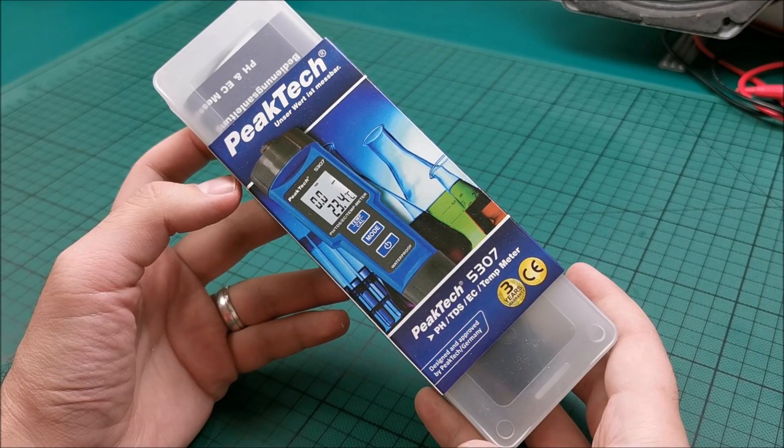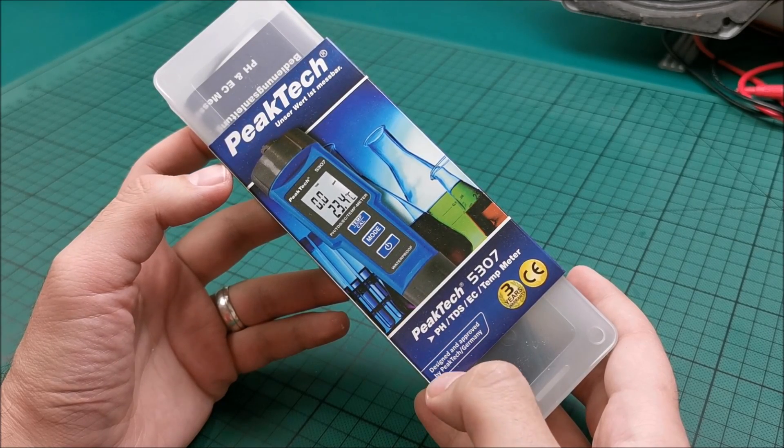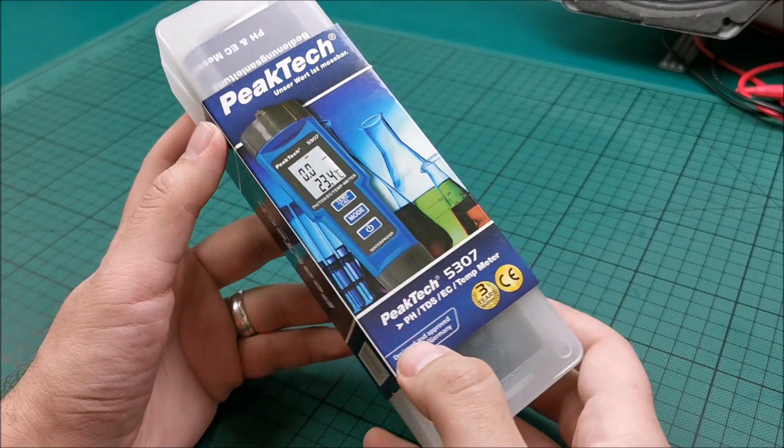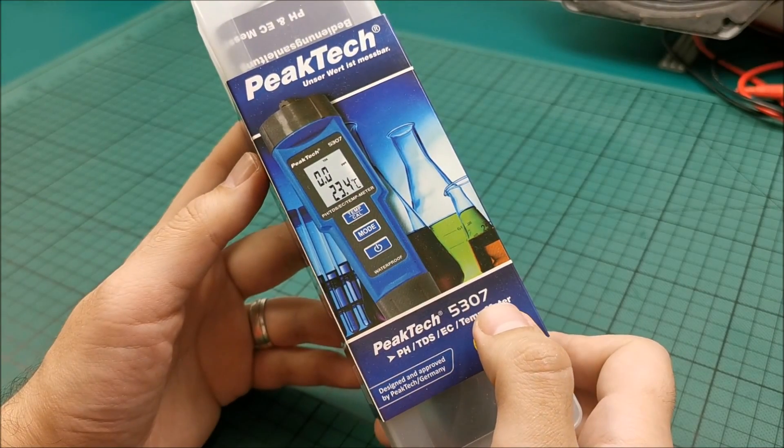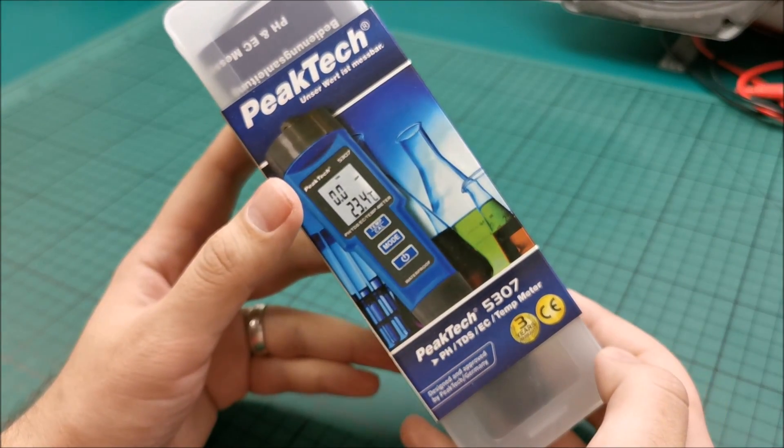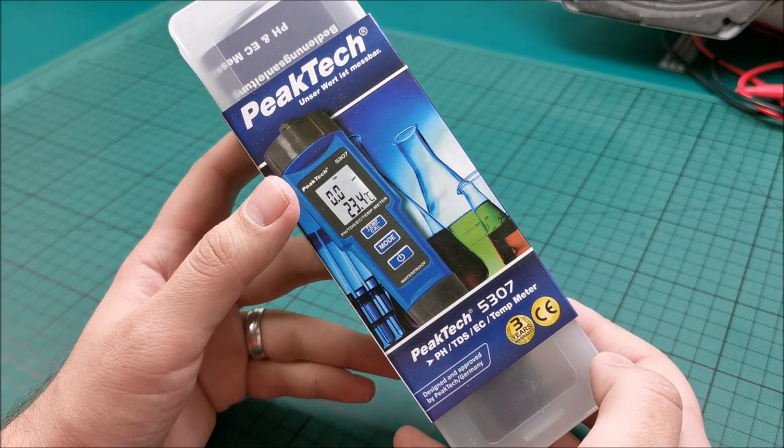Hi there, in this quick video we will be taking a look at this PeakTech pH meter. The model is PeakTech 5307 and thank you for sending this in for a quick review.